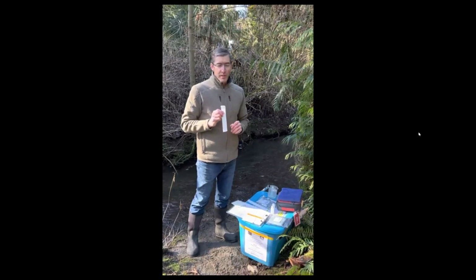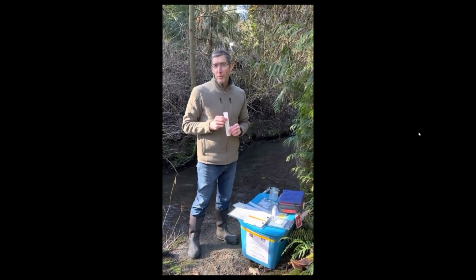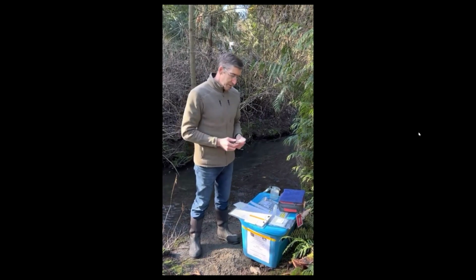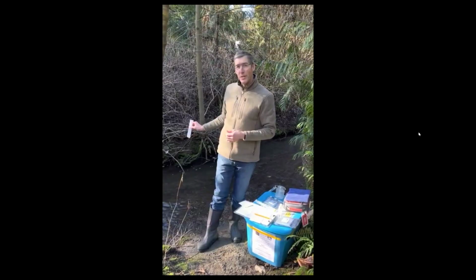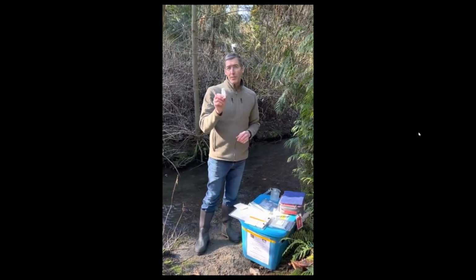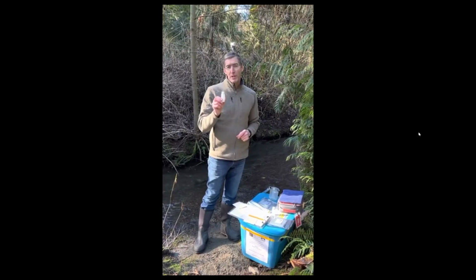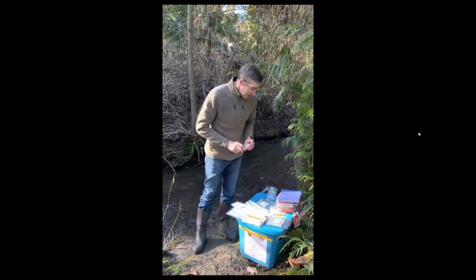Now I'm going to demonstrate a few different ways you can collect your sample, and then I'll demonstrate the process of plating onto the R card. So in terms of collecting your sample, there's 3 different ways. One is you can pipette directly from the stream. Another method is that you can use the sample container provided, the sterile sample container, which can be sterilized and reused, so you don't have to toss this after you've used it.